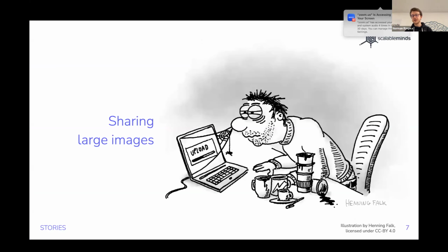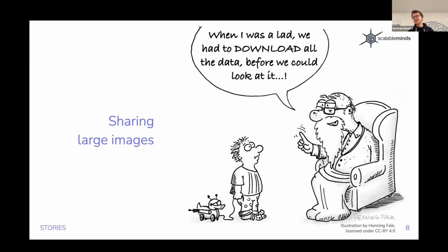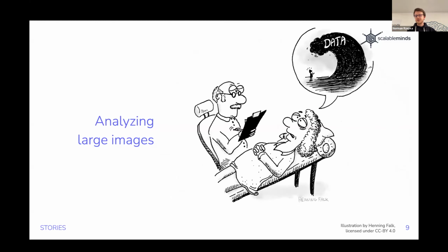You can also upload it to your server, and that's great because then other people can download that and work with that, so you don't have to do shipping and stuff like that. So that's already much better. But still, if the person on the other side wants to work with that data, basically they have to download the entire thing if you're not careful about the file format, until they actually can start working with that data, right? And that's fine if you have a big workstation computer that can fit 5 terabytes, but on my laptop, 5 terabytes wouldn't fit. And so that's another bottleneck in this process. And then, of course, with large data sets, analysis is another nightmare for some, and really needs a new way of working with that.